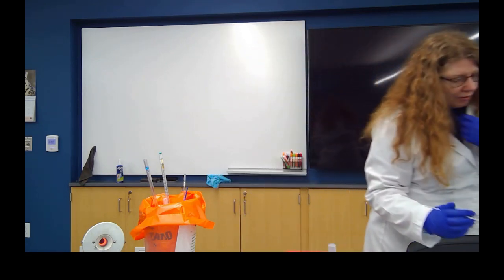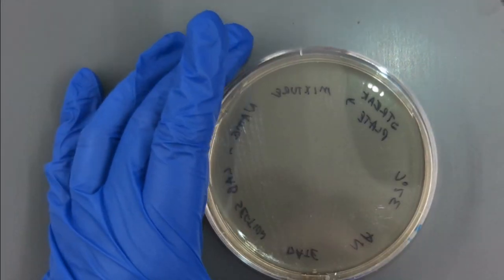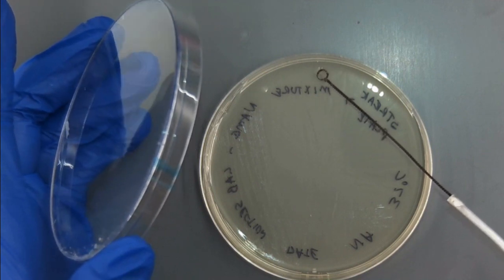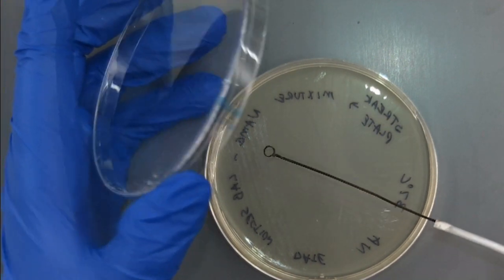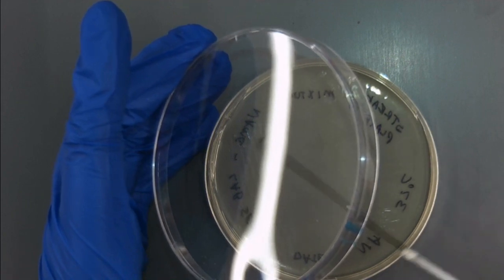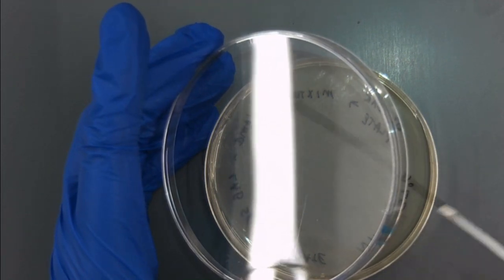I'll go over to my plate. Going to rotate the plate, touch the loop to a corner to make sure it's cool, or a side, I guess a plate doesn't have corners. And I'm going to take the bacteria that I already have on the plate and spread it into a new region. Again, what's going to happen is this is becoming more and more spread out.